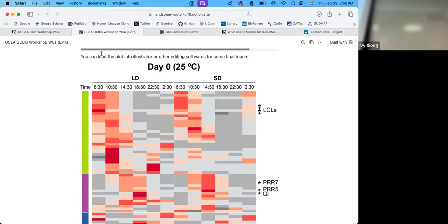Yeah, I think if it does that, if they come through at the same time, it's like the job started and stopped again. That's what I think I got as well. So where was the error? How did you stop it? If you look in the job log that was probably made, it will be in the folder wherever you are. It should be under whatever folder you submitted the bash file from, the sh file.